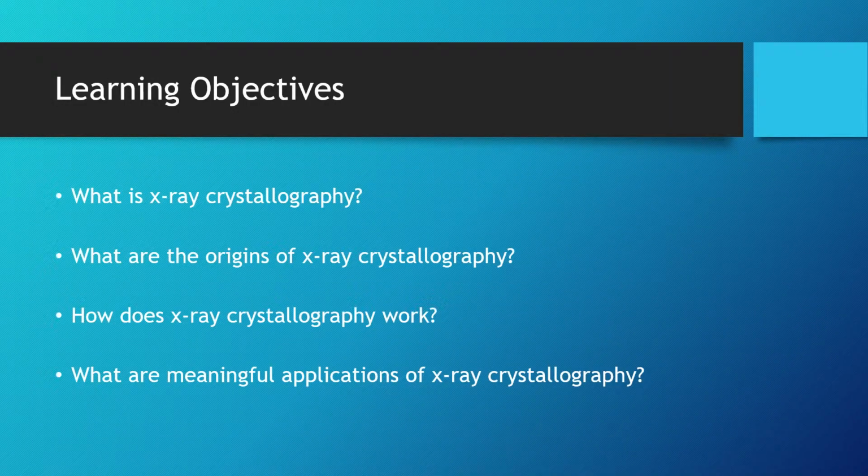Before we get started, I'd like to touch on some of the learning objectives for this presentation. First, we'd like to ask what is X-ray crystallography. Then, we'd like to address what its origins are. We'd like to address how it works, and then what some of the applications for X-ray crystallography are.